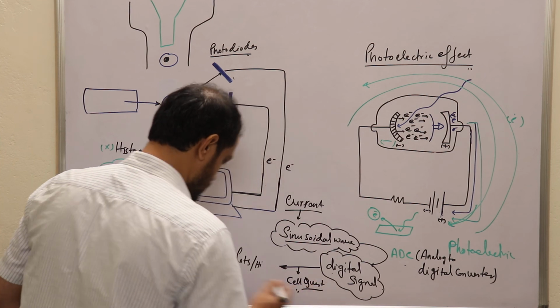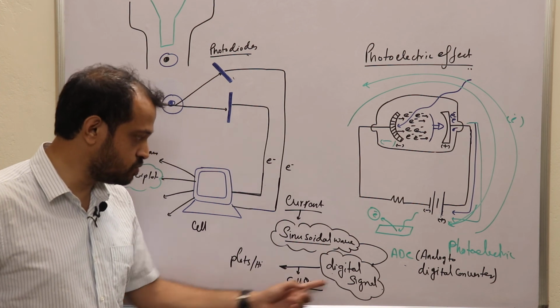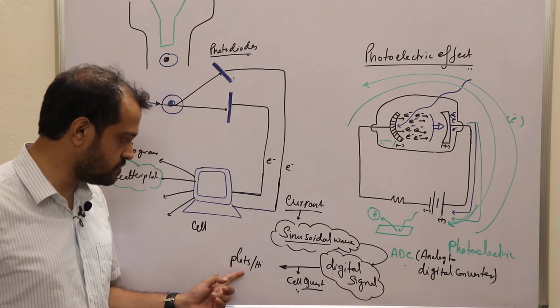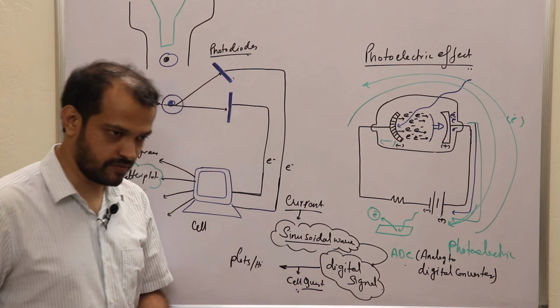CellQuest is one example of these softwares, but there are many others.